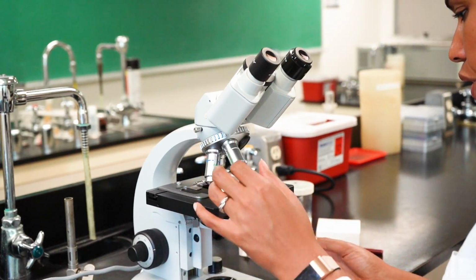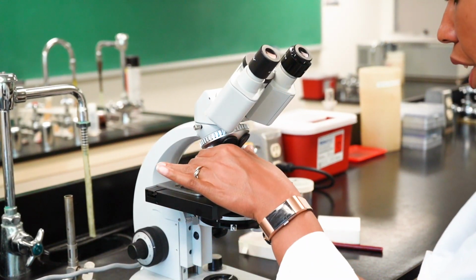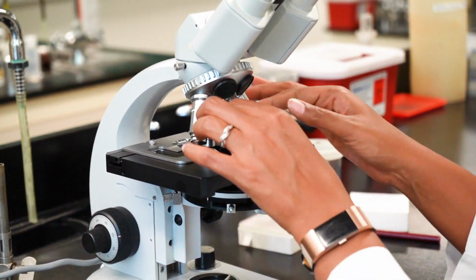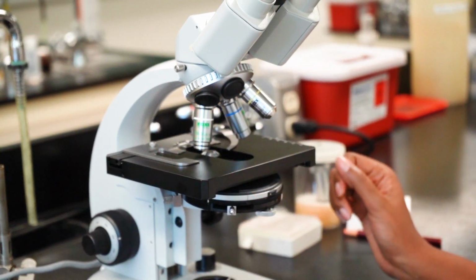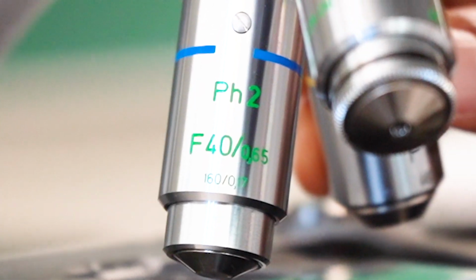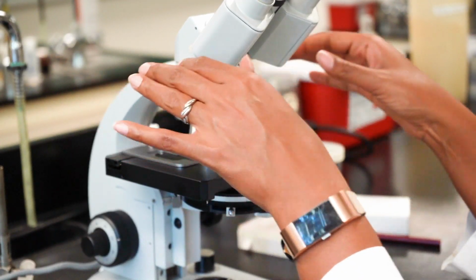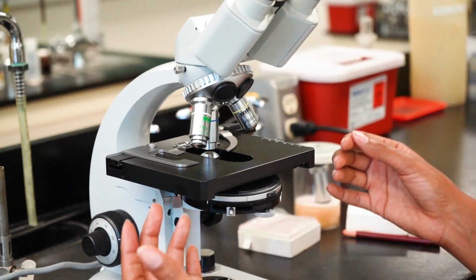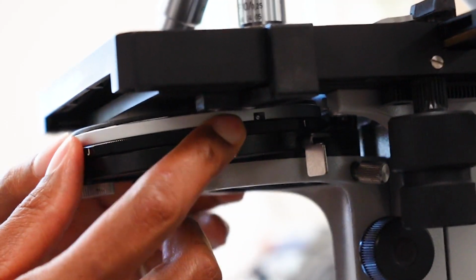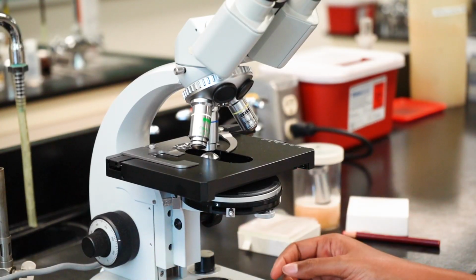So if we wish to view our specimen at medium, or what we call high dry magnification, we have to change our condenser setting. To what, you ask? Well, you have to look at the lens for the proper information. So here on the lens, you'll see pH2. pH2 tells us that we need the condenser setting 2 on this particular microscope in order for us to be successful in phase contrast. So we change our condenser turret setting to pH2.